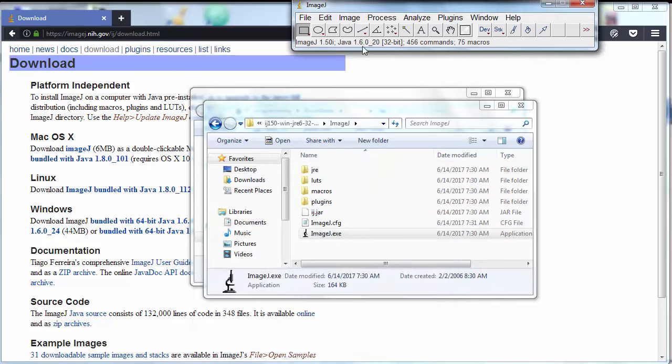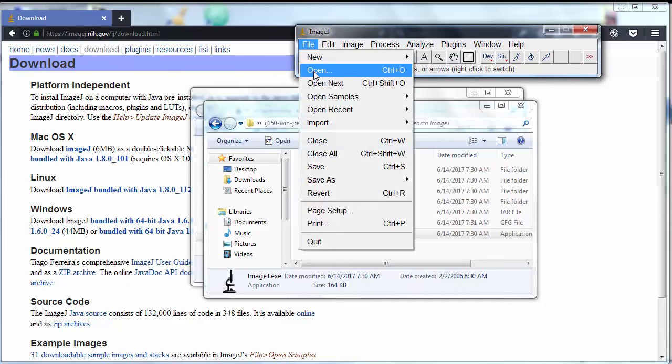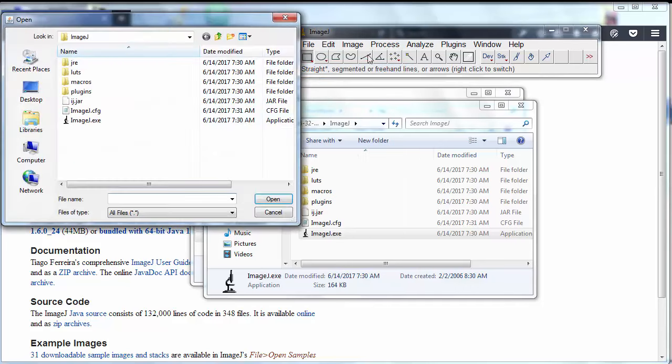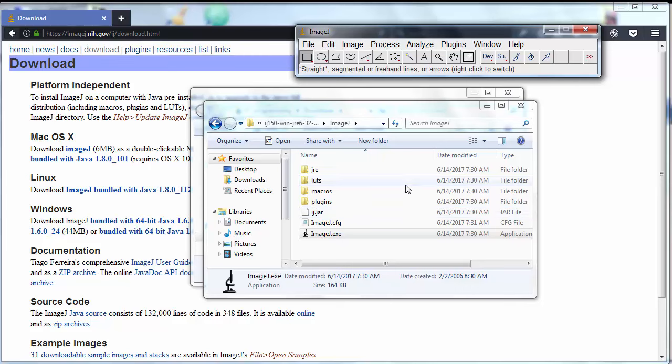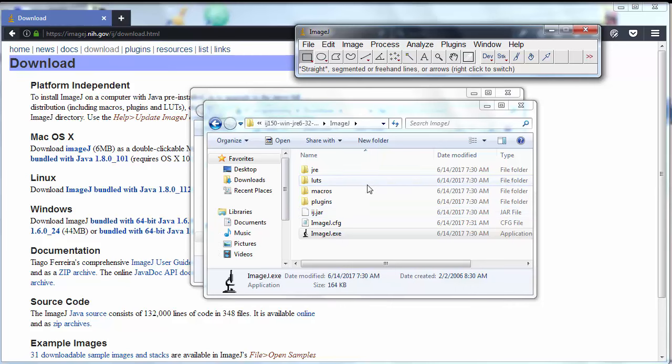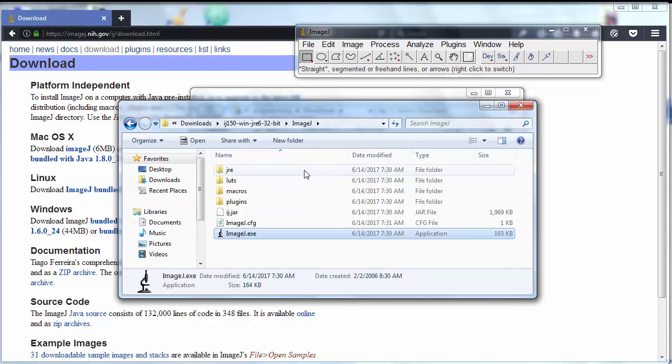And that's it, ImageJ has been downloaded and installed to our machine. But I'm pretty sure that this might be just a portable version of this program.